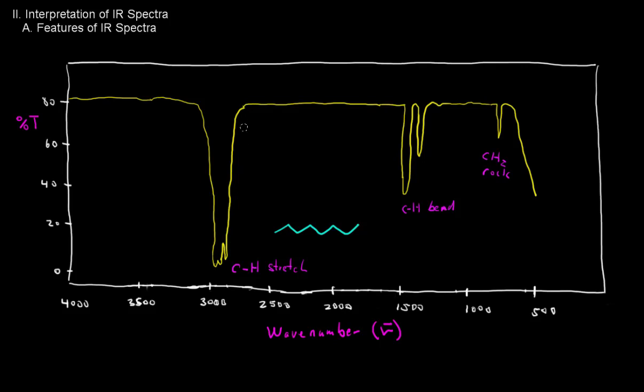So this is a CH stretching frequency. And we expect the CH frequency to be pretty high. This is high frequency here in this direction because the hydrogen atom, recall, is very small. Remember, the frequency is inversely proportional to the masses of the bonded atoms. And since hydrogen is very small, we'd expect the hydrogen stretching frequencies to be fairly high, as we see here.